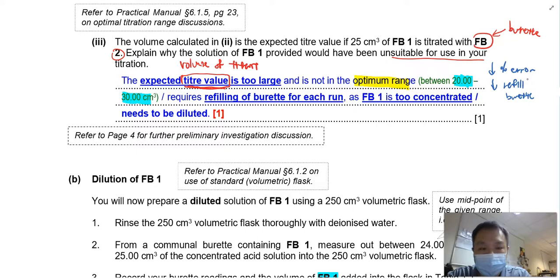So the question is, why don't we plan for a titration to have 10 cm3 or 15 cm3? That's because with every instrument, there's some degree of uncertainty that comes in measurement. For example, if you're taking a burette reading and it shows 0.10, the error itself will be the smallest division, so it can be either 0.20 or 0.00.